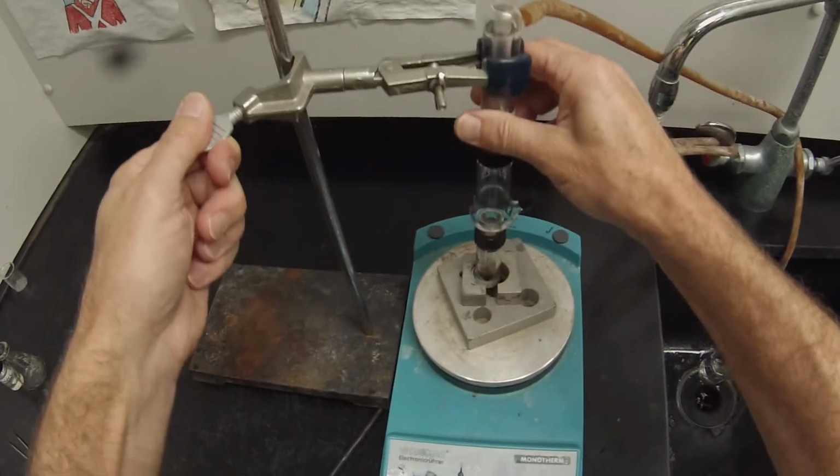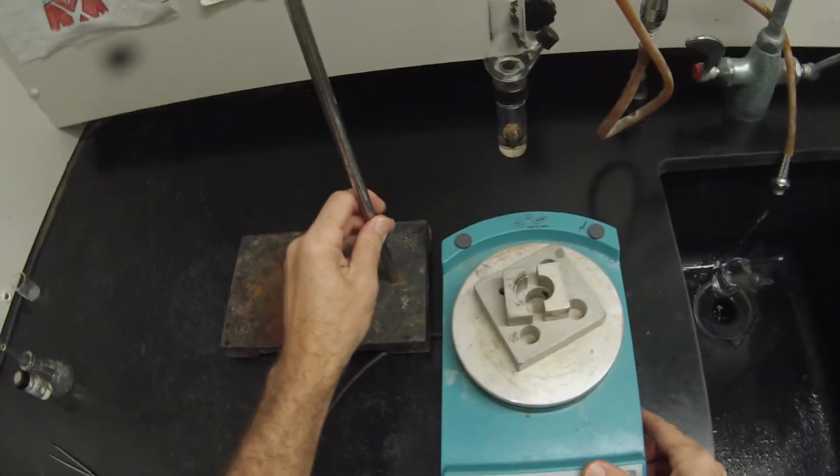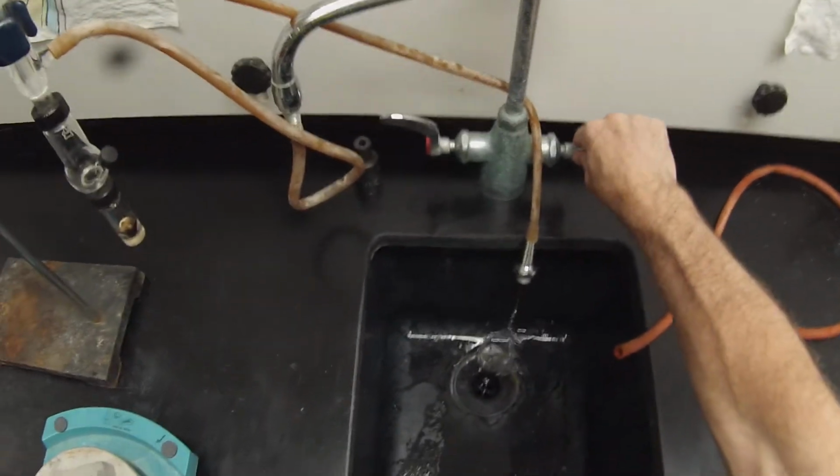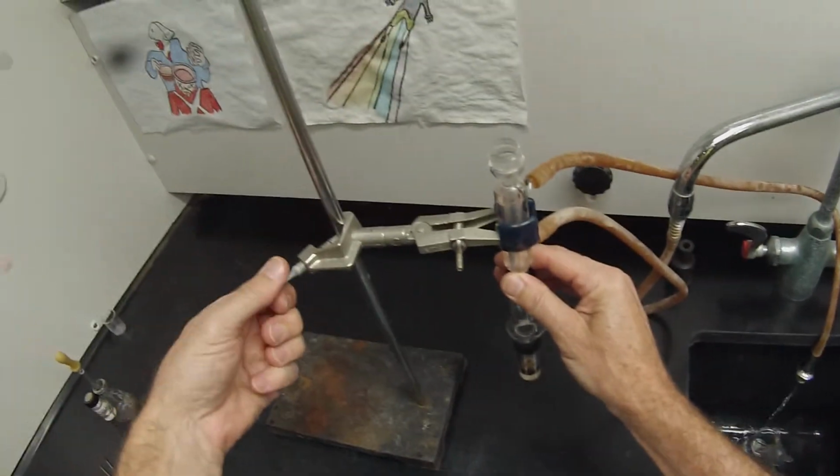And we can just lift that whole assembly up. Best way to cool the hot blocks is actually to just dump them in the sink and run some water on it, but I don't want to break the glassware that's in there. So I'm going to set that aside for a second. Turn off our cooling water. Lower that down. Try to make sure I don't touch that.